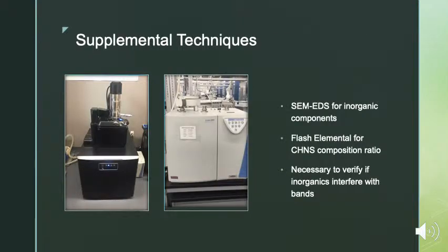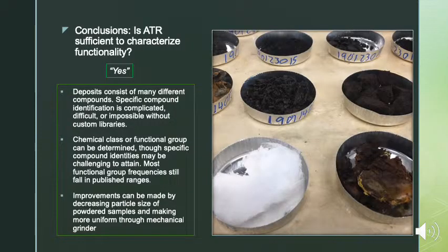Now, thankfully, IR is not the only technique in use for characterizing samples. As supplemental techniques, we also use SEM and EDS for inorganic components, and an elemental analyzer for CHNS composition. So, is ATR sufficient to characterize our solid samples? Well, the answer in general is yes.